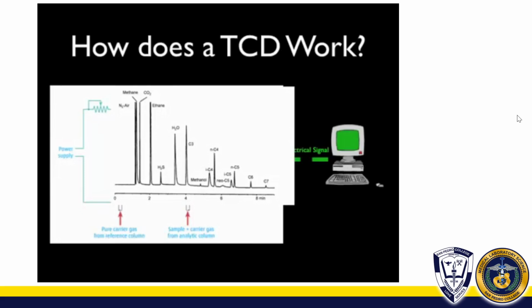The Wheatstone bridge measures the resistance values in your TCD, and it could also be used for calibration of different instruments. So that is why it is important to place a Wheatstone bridge, especially in your TCD.